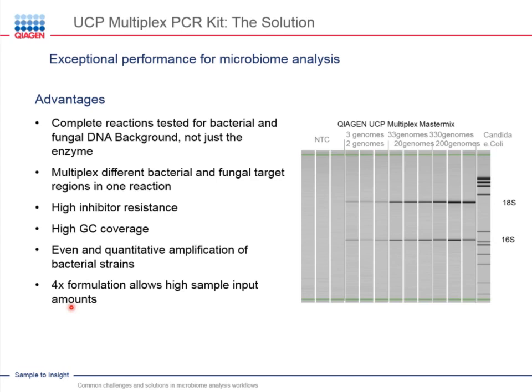In addition, I'm not showing this here, but I have sequencing data where we have sequenced mock communities, and this mix is highly quantitative. So we came out with the bacterial abundances which were added to the kit. So that's the one part of the story.